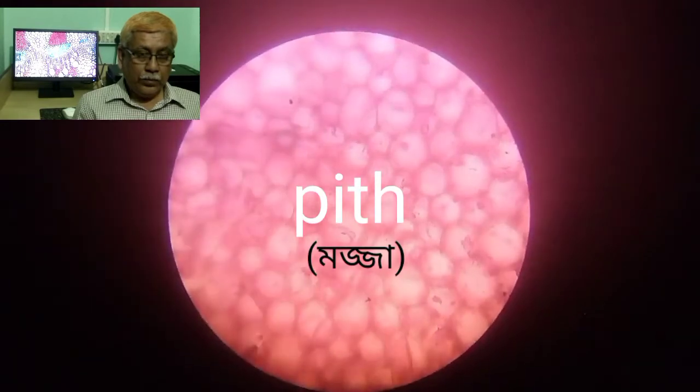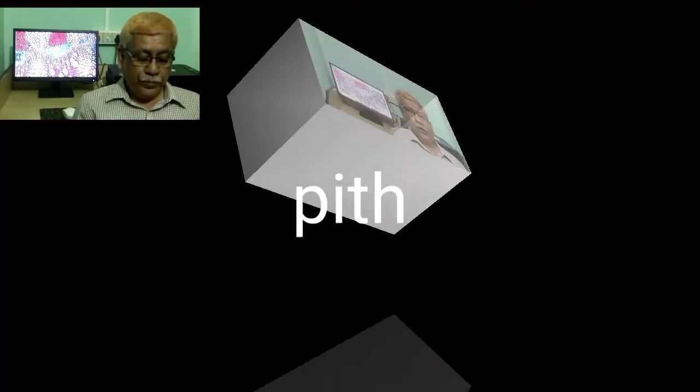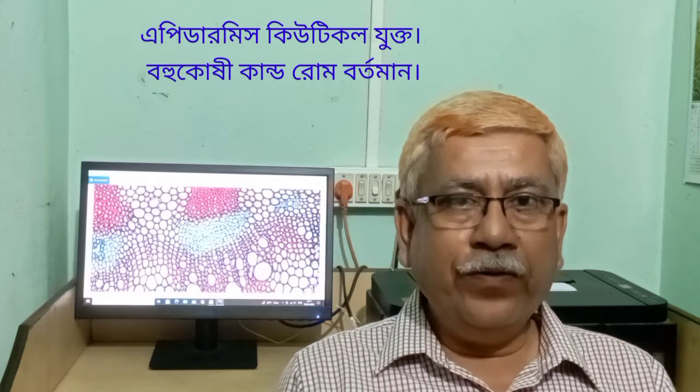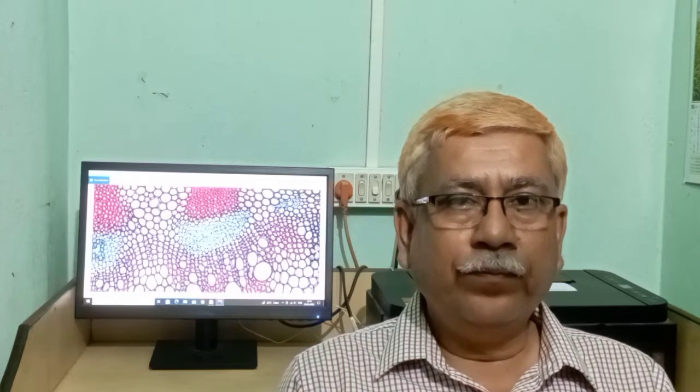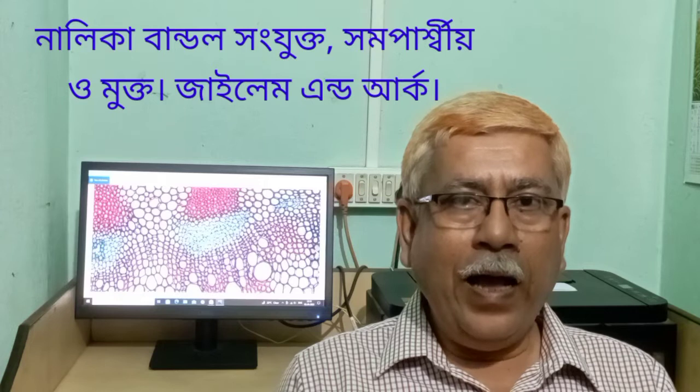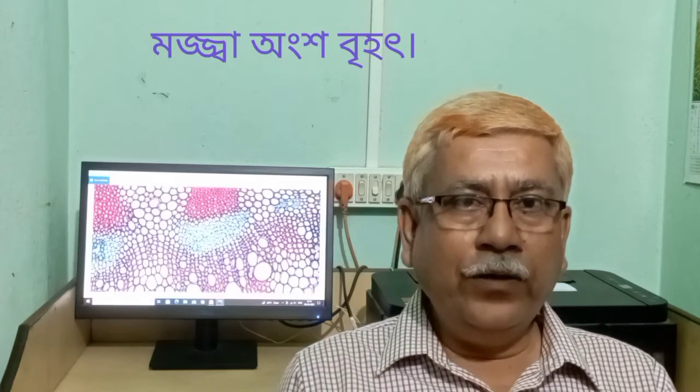This is pith. Identifying features: epidermis is cuticularized with presence of multicellular stem hair. Vascular bundle is conjoint, collateral, open, and endarch. Presence of medullary rays and presence of large central pith. Now take your practical notebook and draw a labelled sketch of a portion of TS of sunflower stem, then write the salient features of dicot stem.